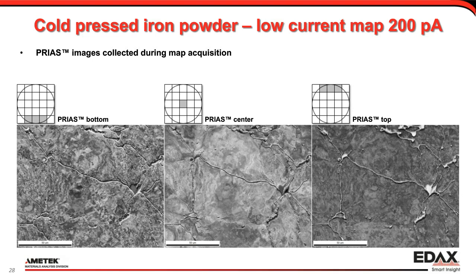You can actually see that at the interface between the larger granules, there's a little bit of depth there, some trenches along the grain boundaries. It's not been annealed, and that is really nicely shown.